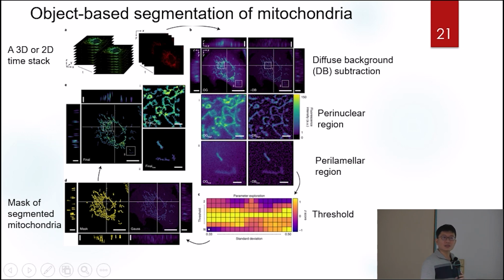So do you know the mask in image processing? What do you know what that means? No. Okay. So when you take an image of mitochondria, you know the intensity of mitochondria, right? But for a mask, it means that if there is mitochondria signal there, I will give you, okay, this is 1. So you can assign, okay, the mitochondria here is 1, others are 0, they are all background. So from this, you don't know the mitochondria intensity, you only know the location of mitochondria.